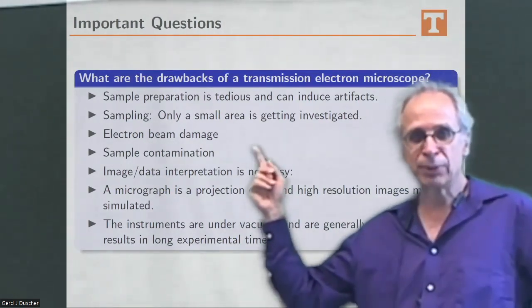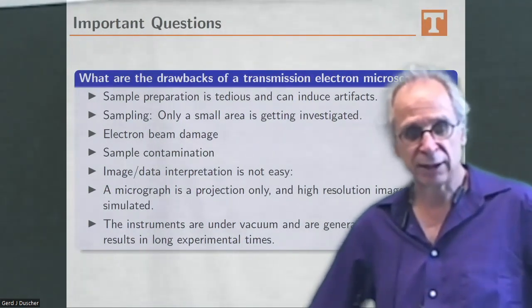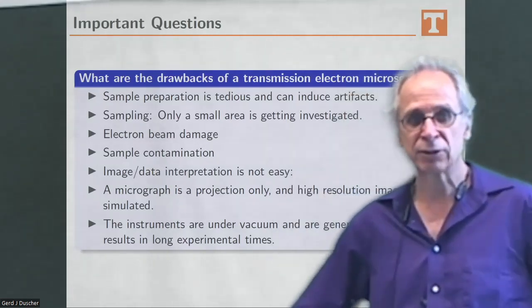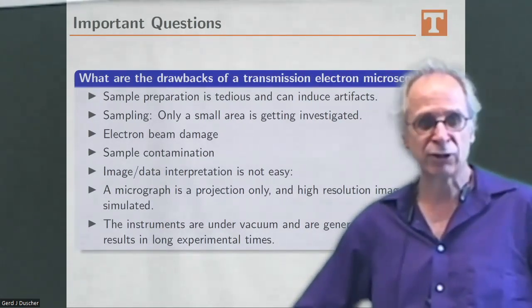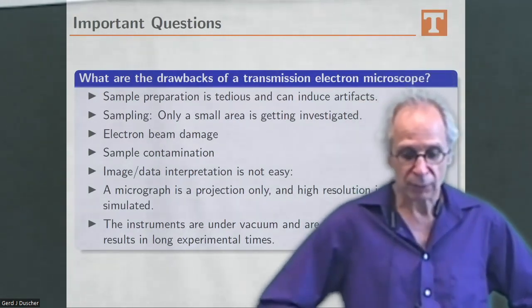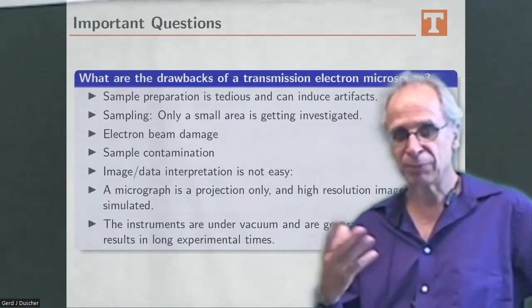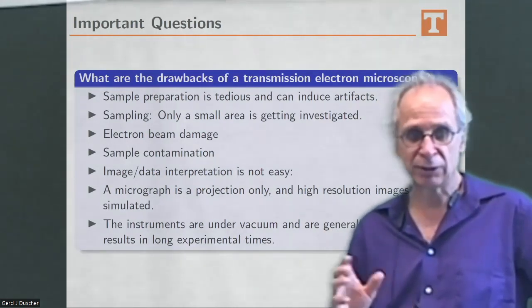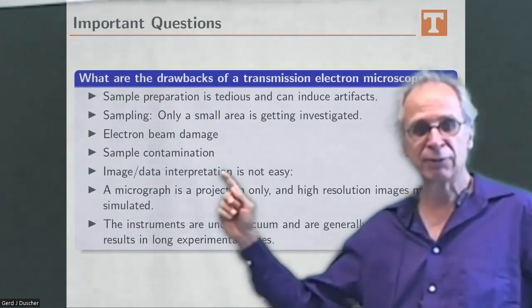We have electron beam damage. That is usually dose related, and so controlling dose and the amount of incident electrons, and when it does something, is a key thing in quantification. The electron microscopists in biology are much more advanced on that than we are in material science and physics. So again, something you can combine.